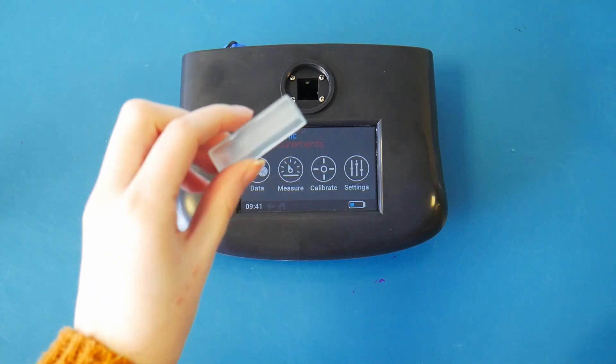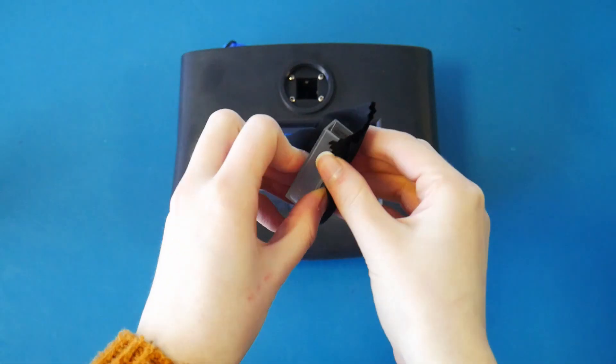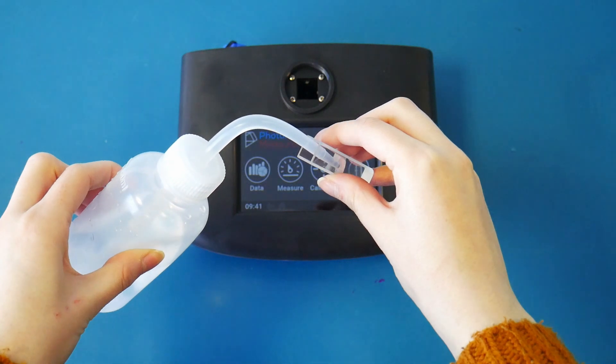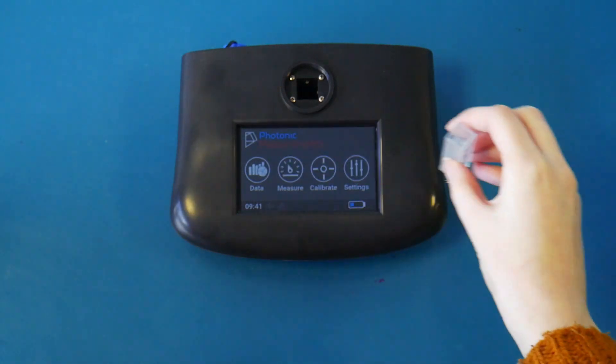Take the cloth and wipe the cuvettes to ensure no residue is left. Place three quarters of the sample into the cuvettes. Give it a swirl and tap on the surface to remove any water bubbles.